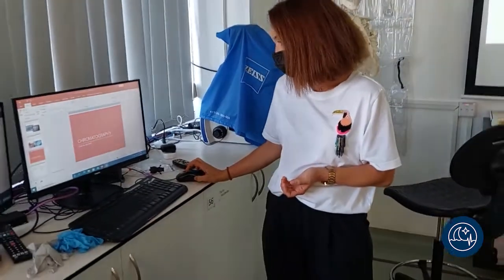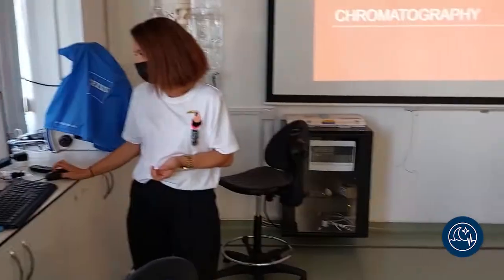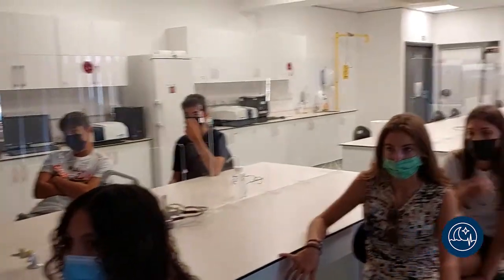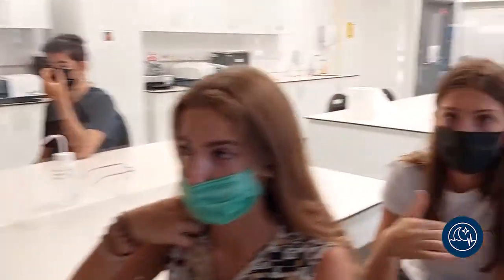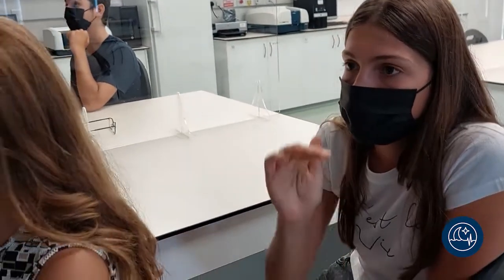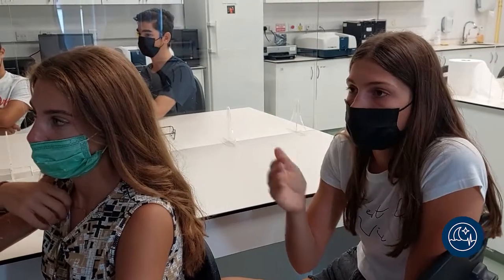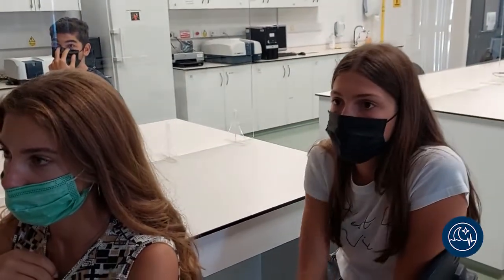Brilliant. Did you guys understand that? Mm-hmm. Okay, so what's chromatography? This is where we're going to do our experiment. What's chromatography, guys? Alex? So there is a chromatography paper, and you can add like the ink, and if there is a match on top, then you know it was the ink used. But if it's not on top, then it doesn't match.